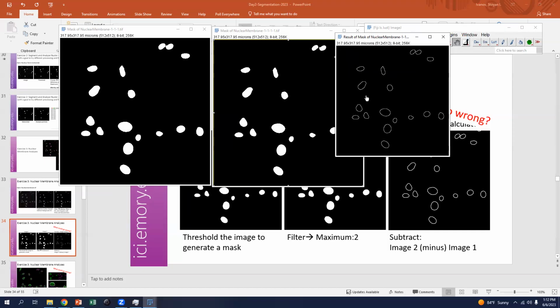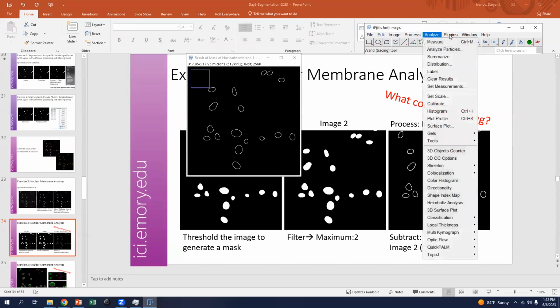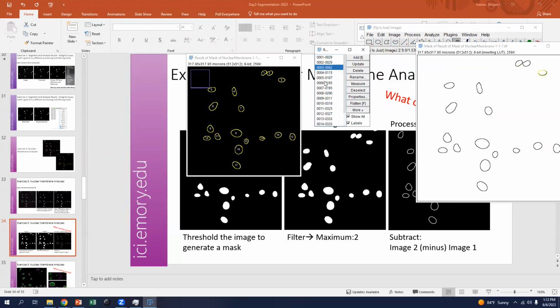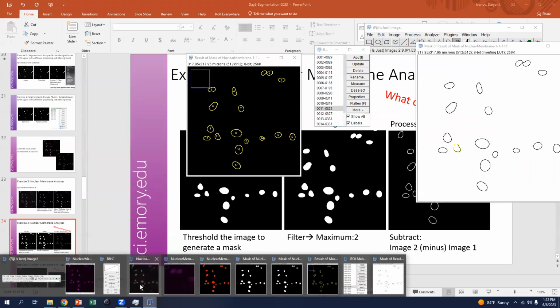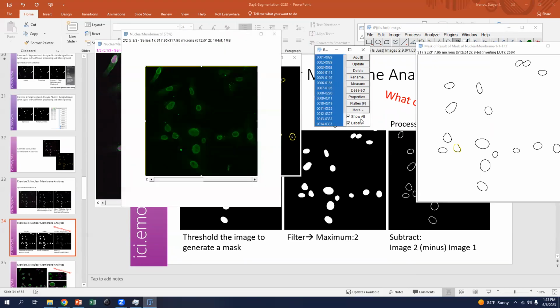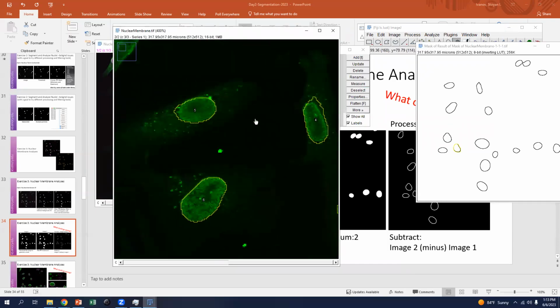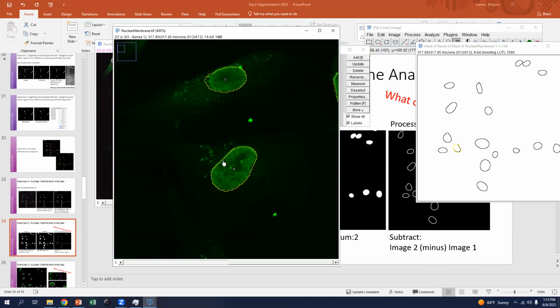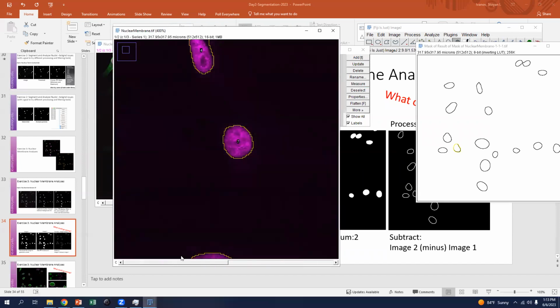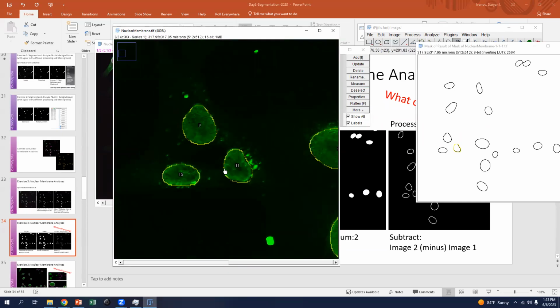Now, the only thing left to do is to see if they fit around the nuclei correctly, and if we can create a particle analyzer of them. And we can. We see each one here. And we can then go back to our first image and show them all. But what do we see? That the calculation we made doesn't quite fit along the perimeter, in both channels. It fits this guy pretty well. This guy, but it's not great for all of them.